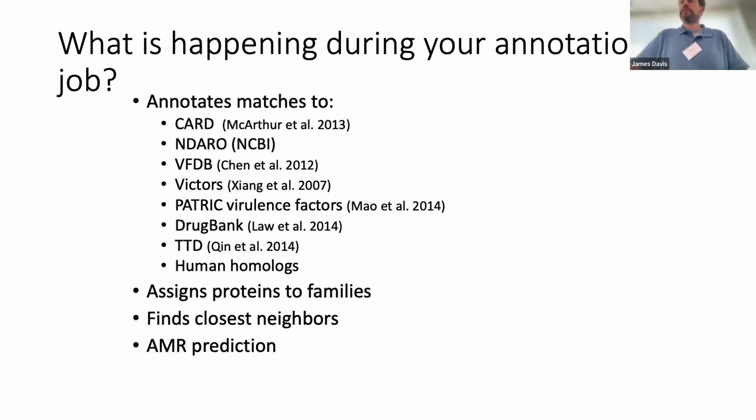Yeah, so I think the people who are working with organisms that are not well covered or not similar to some of the other pathogens that we have in the system, we would be interested in knowing what those pathogens are. And maybe during the break, we can look at some of the public genomes that are there in the system and see how well those genomes are annotated. And if you happen to know more about those organisms, then you can take a look at it and tell us whether you think we have enough coverage in terms of assigned function, or whether there is a major gap between what we have and whatever are your other favorite tools or databases. If that's the case, then I think we can systematically go after them and try to improve the coverage.